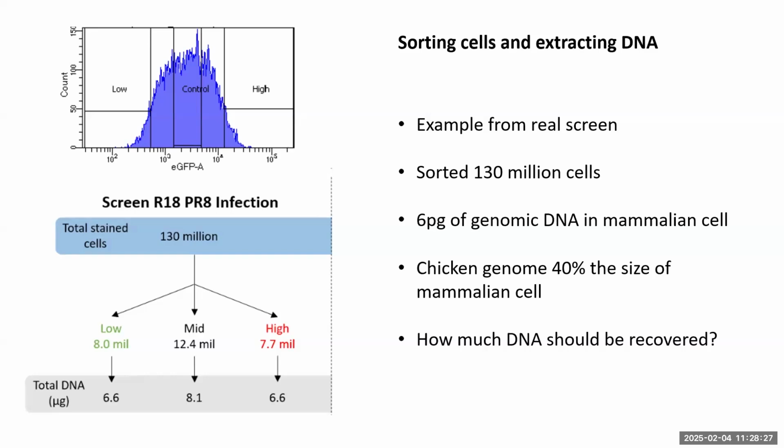So essentially you do, what is it? It's 6.6 micrograms, 2.5 picograms per cell. You divide the 6.6 by the 2.5, and then you divide that by 70,000. Gives you about 37. So that sounds quite low.